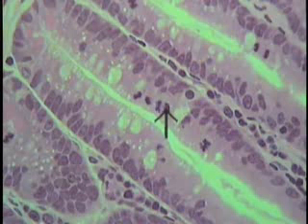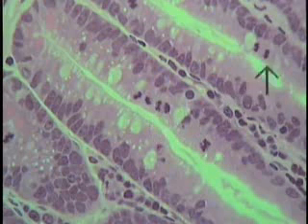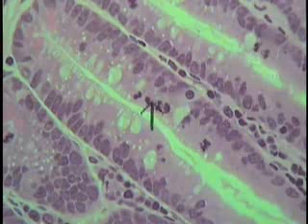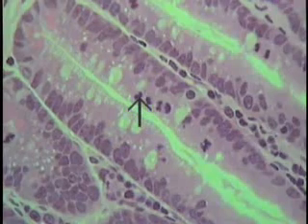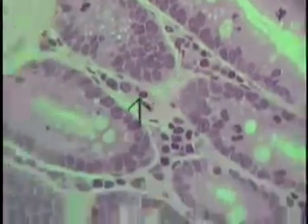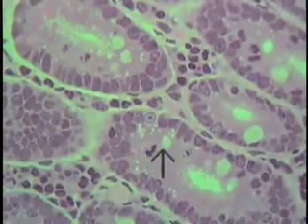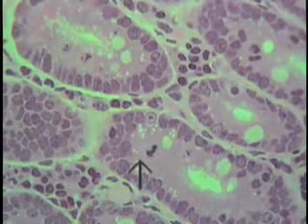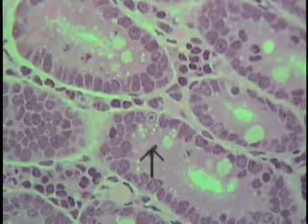One chromosomal mass for this daughter cell located here, the other one here. So this is roughly an earlier anaphase, a late anaphase, and then perhaps where the chromosomes are starting to dissolve here a little bit, separating into two different cells, probably a late telophase at that particular location. Probably a metaphase here, the cytoplasmic boundary being here, and then the chromosomes lined up along an equatorial plate.